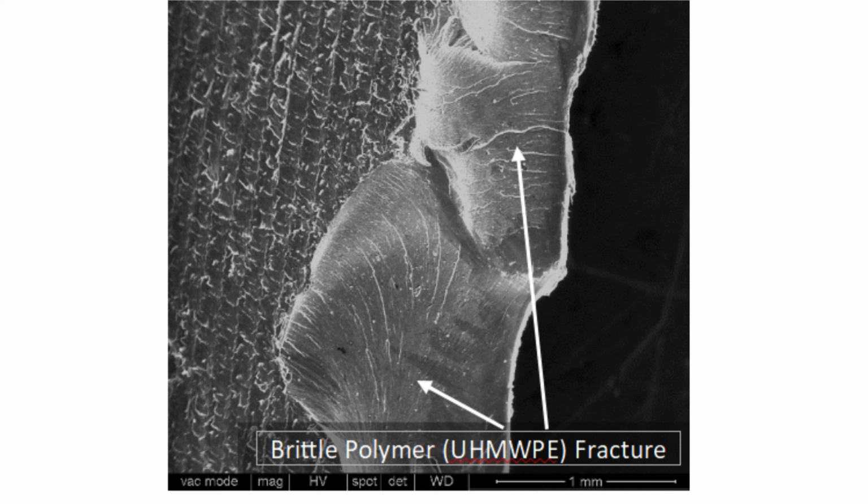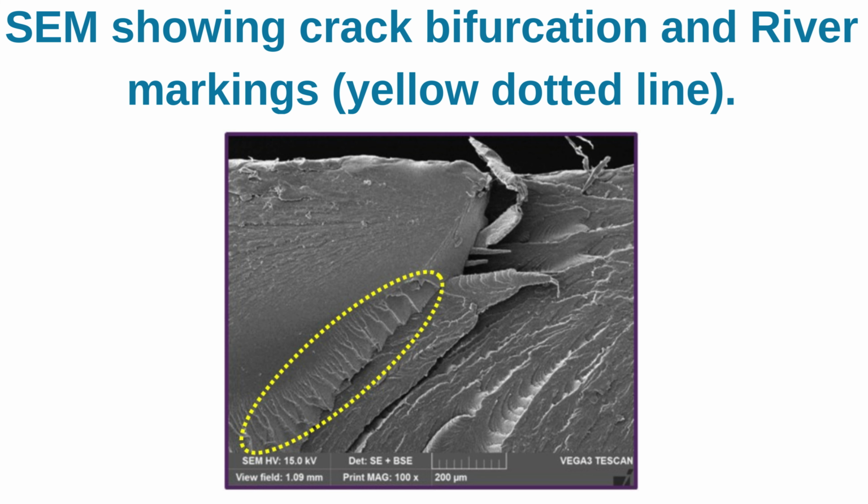Almost no deformation of the resin. Cracking progresses rapidly, leading to fracturing. Even ductile materials can develop brittle fractures due to factors such as load conditions, environment, etc. The characteristic shape of the fracture surface is called the river pattern.